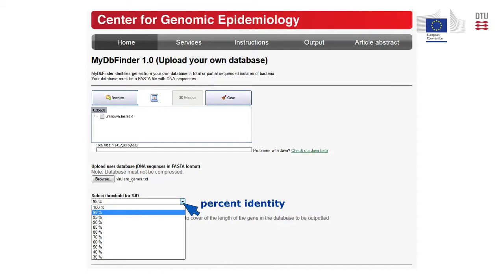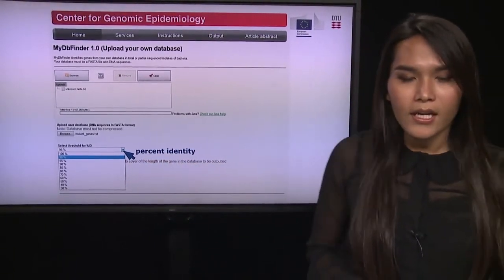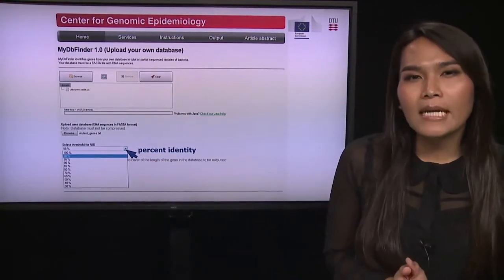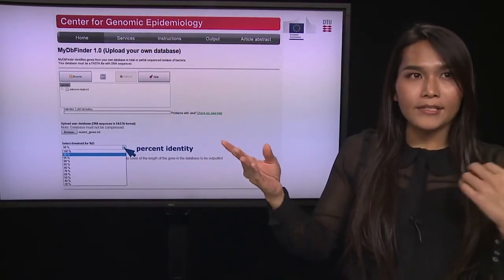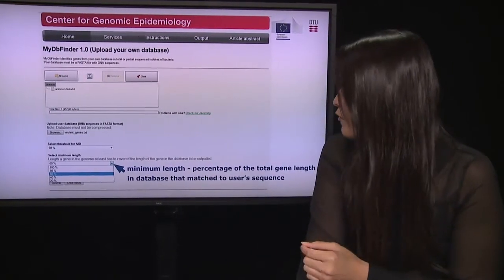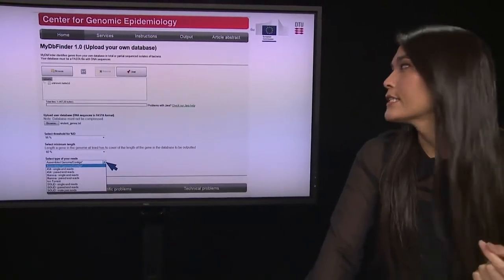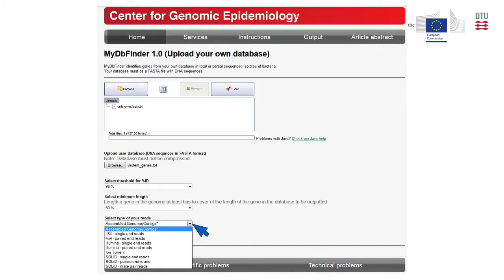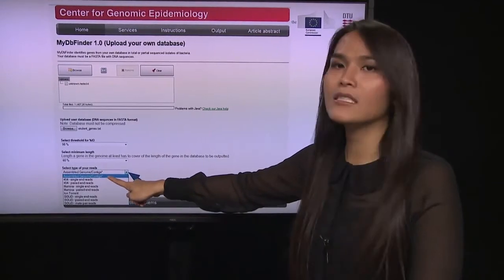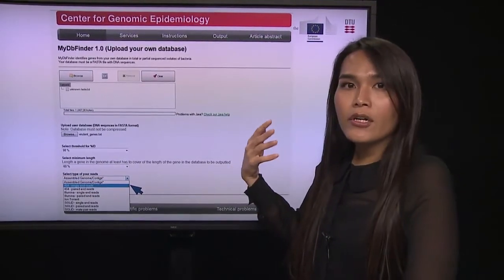Once you browse your database, you need to choose some of the cutoff options provided. The first is percent identity — the minimum percentage of nucleotides that are identical between the sequence from your unknown sample and the genes in your database. Another cutoff option is minimum length — the percentage of the total gene length in the database that matches the sequence in your unknown genome.